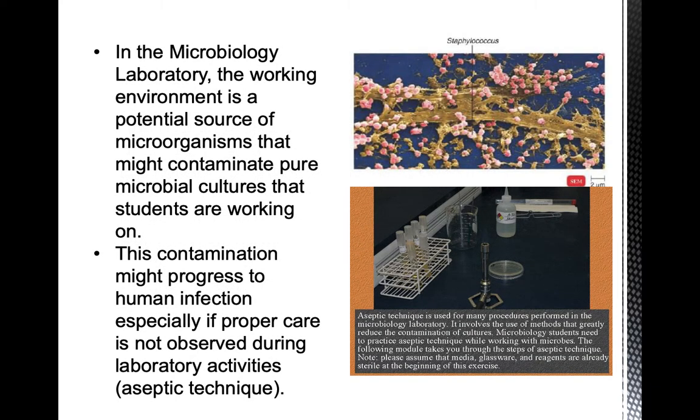In our microbiology lab, the working environment is a potential source of microbes that can contaminate the pure cultures that students are working on. And this contamination process can progress to human infections, especially if proper care is not observed during the laboratory activities. I remember showing you a generalized video on aseptic technique, right?